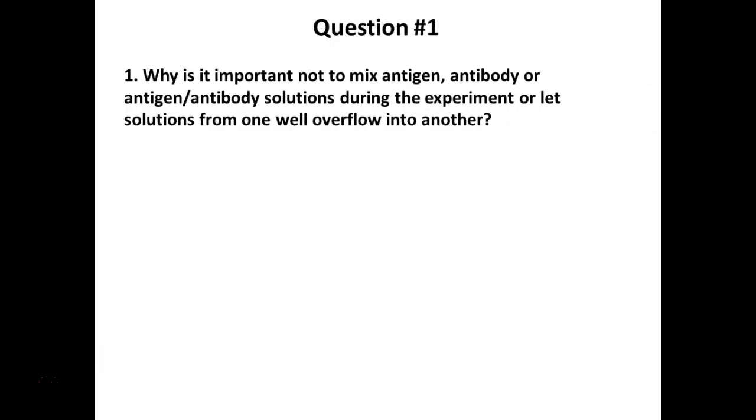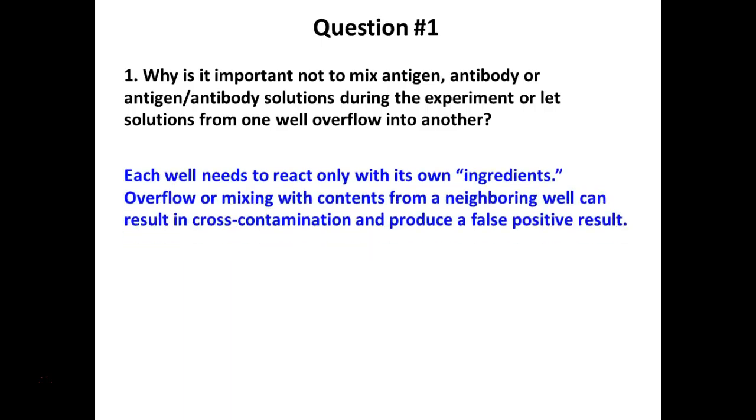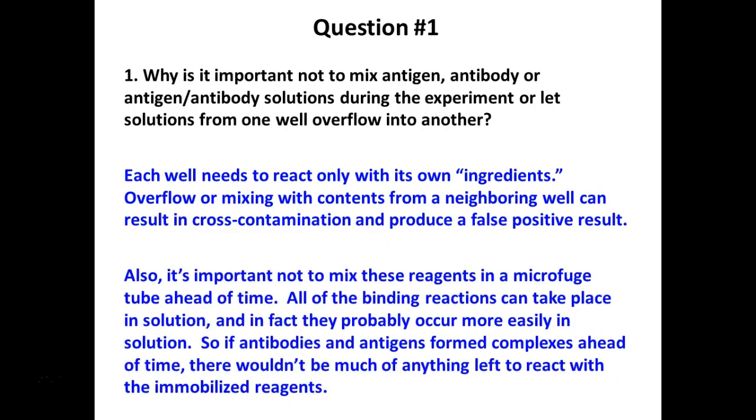So why is it important not to mix these reagents during the experiment or to let the solutions overflow with each other? Yeah, you're not going to get the correct result. If you just mix it all up, you're going to get false positive results. We don't want that.